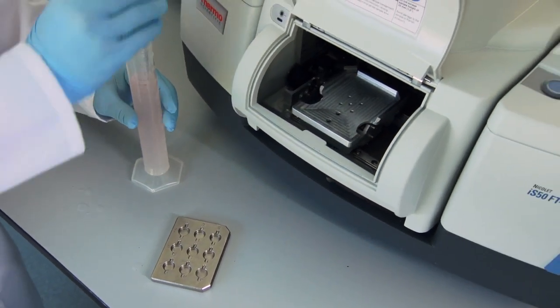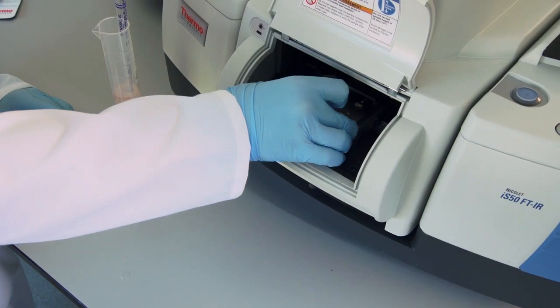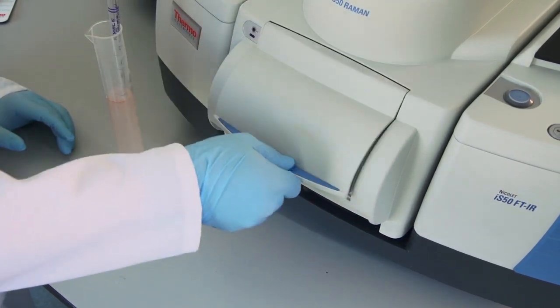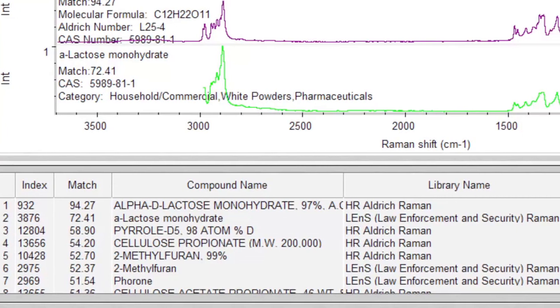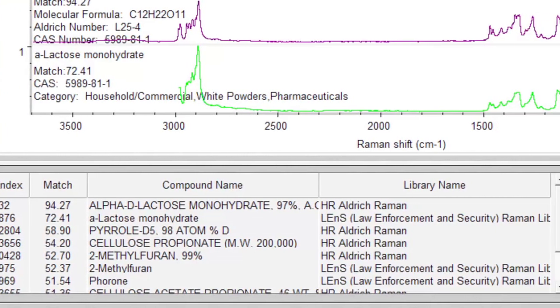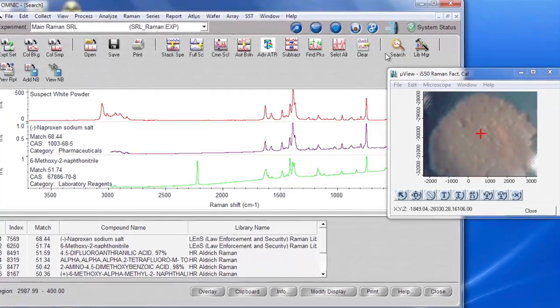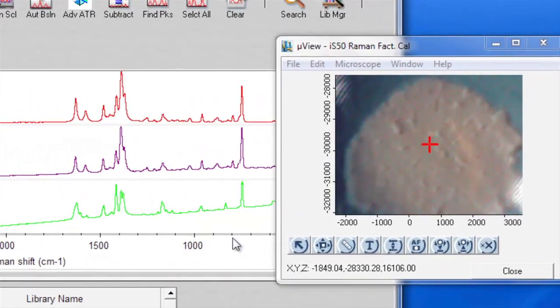Incorporating everything you need to measure tablets, powders, liquids in vials, or single crystals down to 50 microns in size. And the OMNIC software and Raman forensics library assist in identifying unknowns, while the Raman module's video capture helps document results.